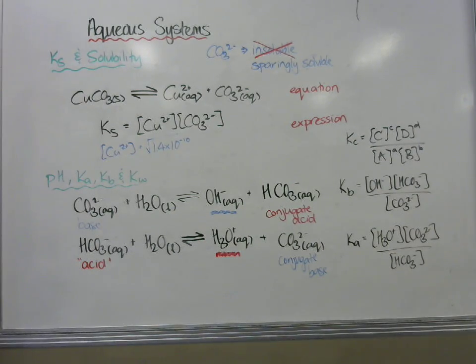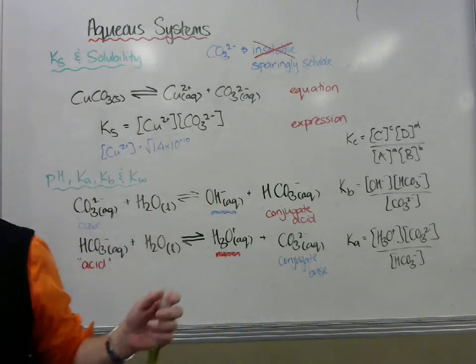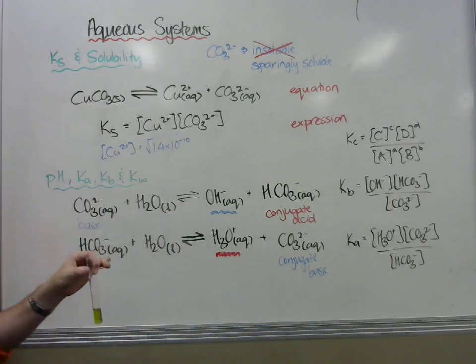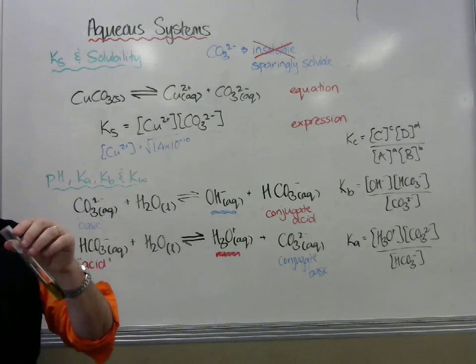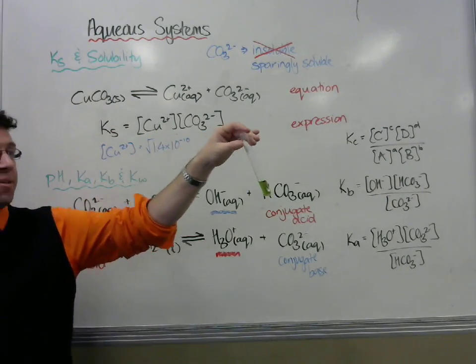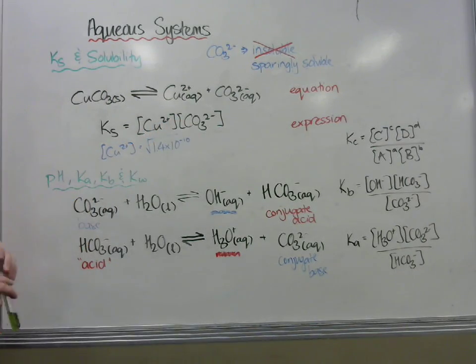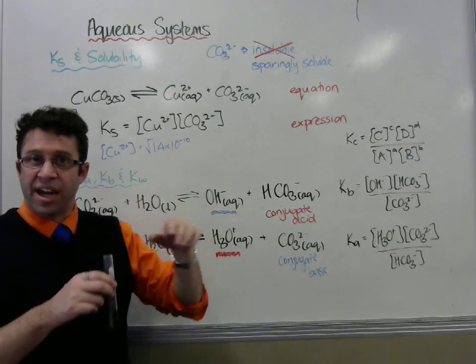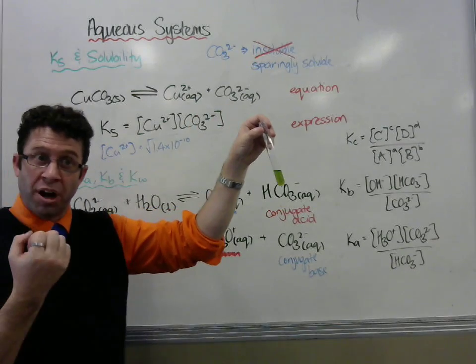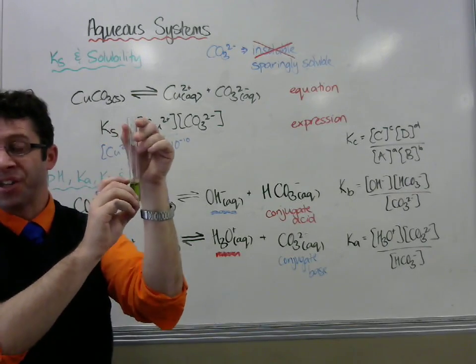The only other thing in this topic, and it's not going to work, but I'm going to show it to you anyway, is in here I've got some carbonate ions. If I was to add hydrogen carbonate ions as well, and I'm only going to add a couple of drops because I don't want to mess with it too much, then I create a system called a buffer. And if I was to add an acid or a base to this, its pH stays the same because it has both the base and its conjugate acid present in similar concentrations, which allows it to absorb hydronium ions or absorb hydroxide ions and keep the pH the same. That's the last thing we're going to learn about because it's probably the hardest bit in the topic.